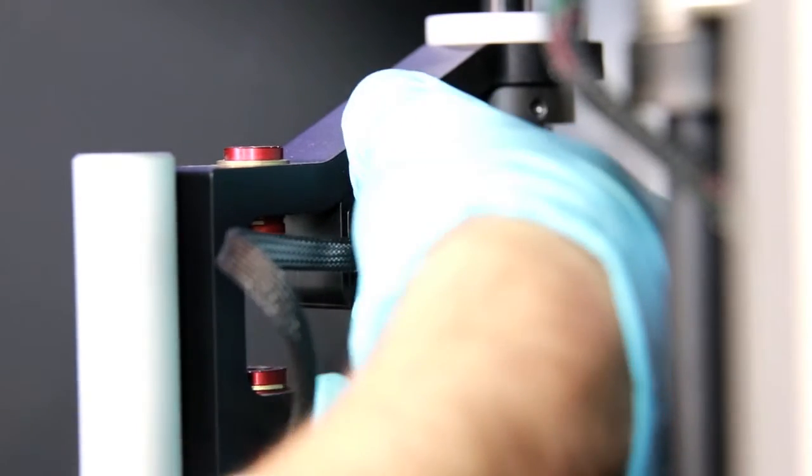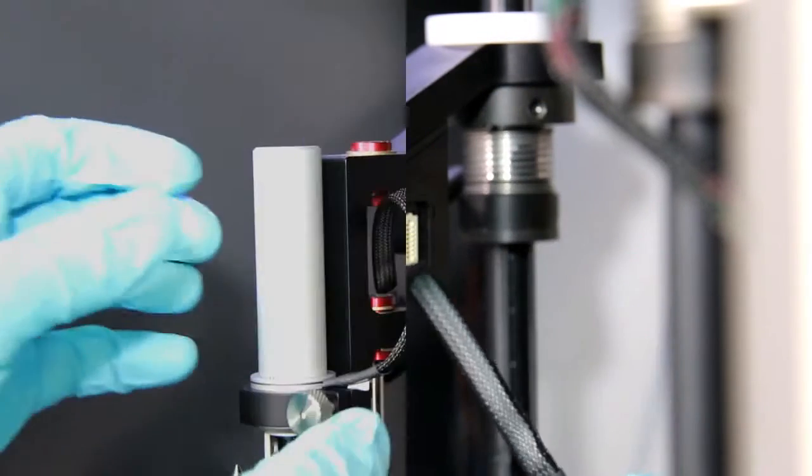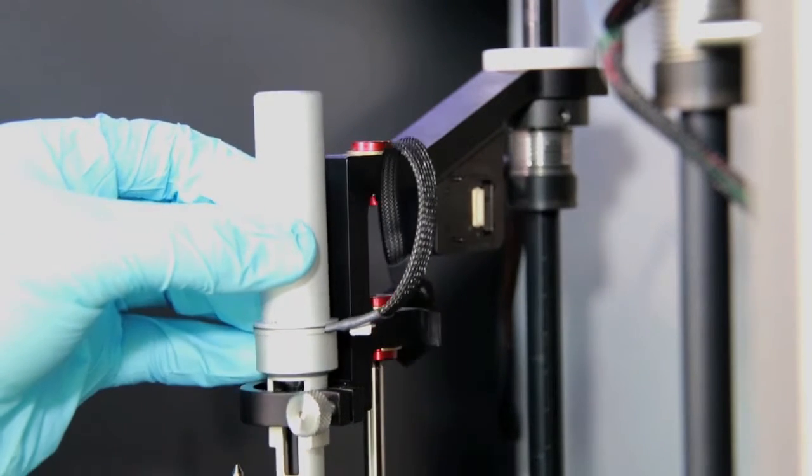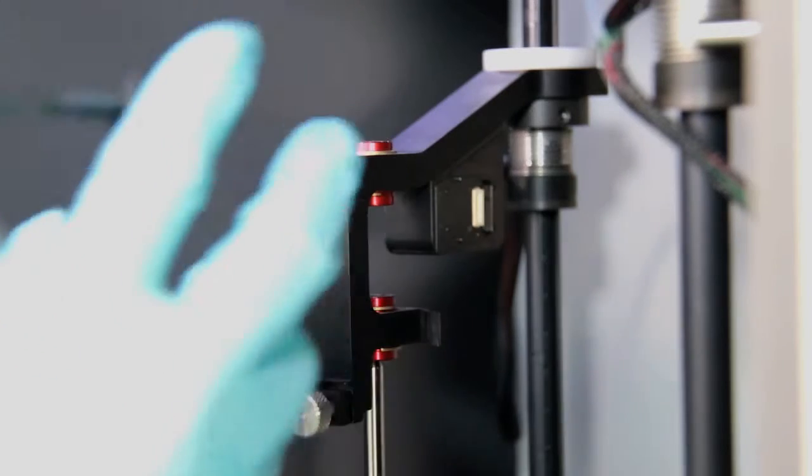Remove the cable from the arm. Next, we loosen the collar holding the pipette to the arm and simply slide the pipette out.